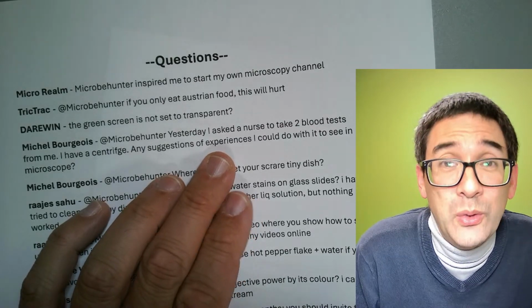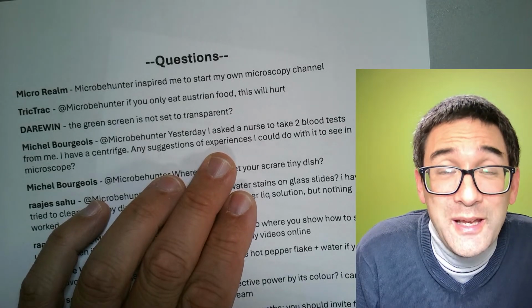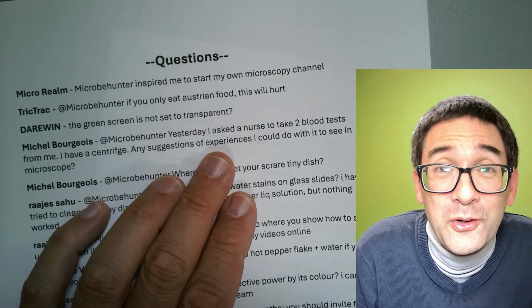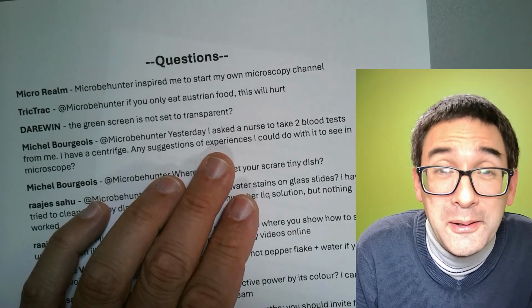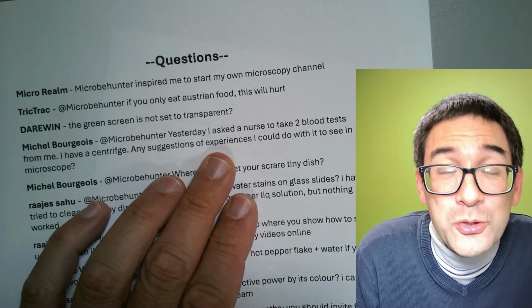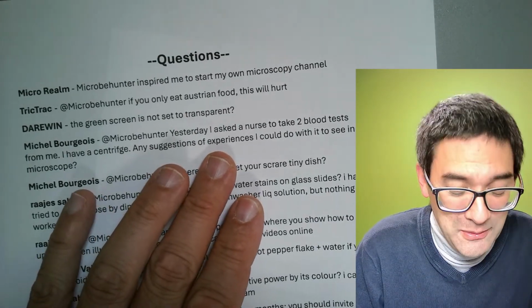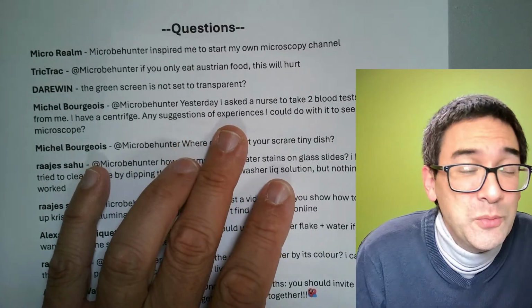And when you found one, then without moving the slide, just take a video of it for 10 or 15 minutes, and then you speed it up, and you can actually see the movement of the white blood cell. It moves around like an amoeba. If you just look at it under the microscope, the movement is so slow that it's very difficult to see. But if you speed it up, you're able to see that some of the white blood cells actually move around like amoebae.